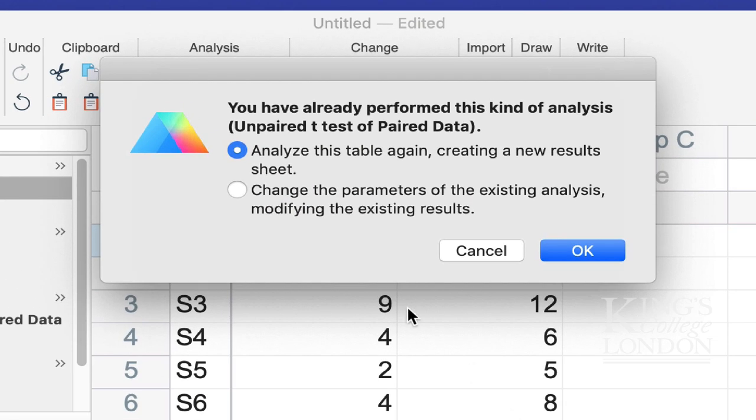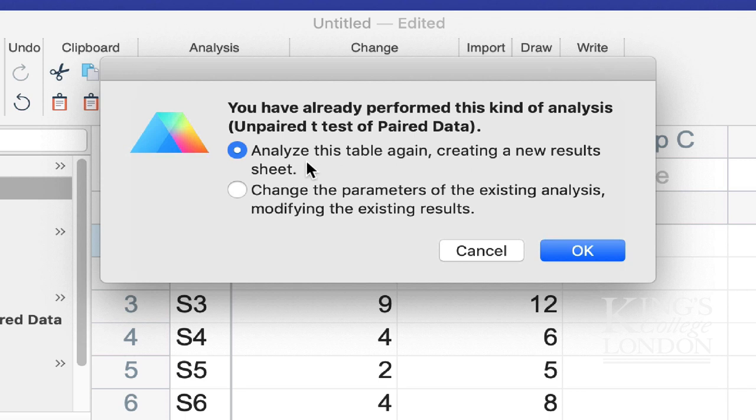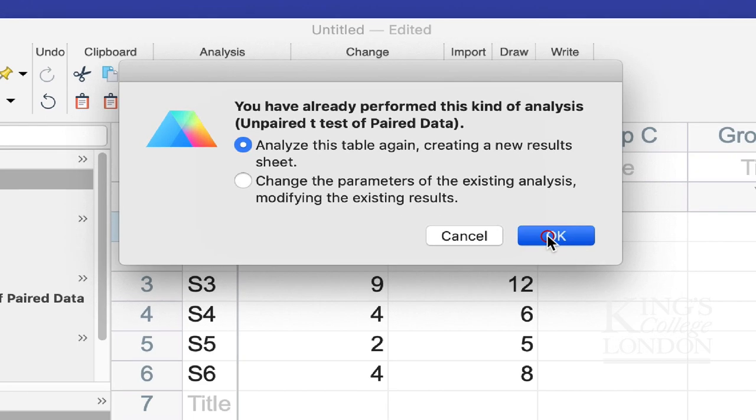I've already analyzed these data with an unpaired t-test. So I'm going to analyze these tables again, creating a new results sheet, and then I can compare my unpaired with my paired analyses. I'm going to click OK.